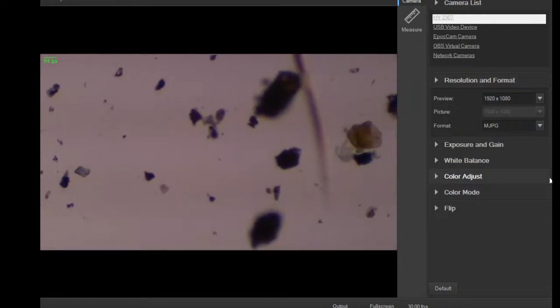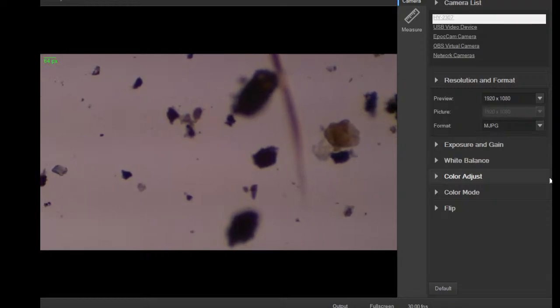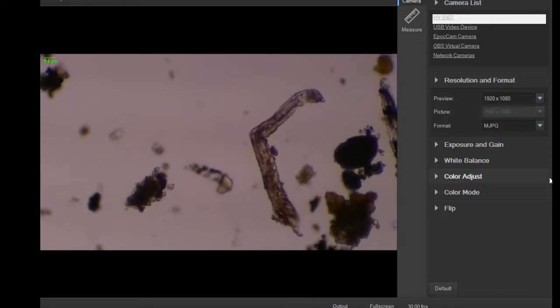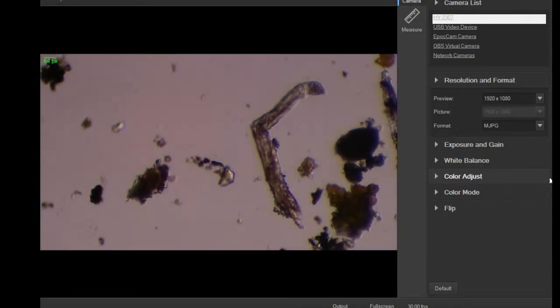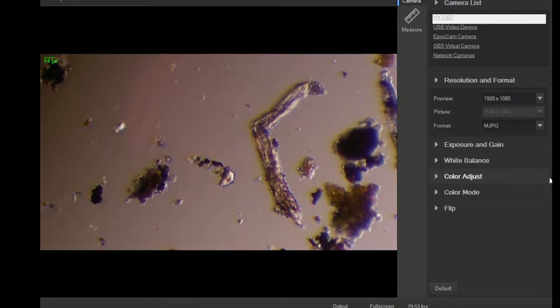Alright. Pretty small one too. It's about 100 power. There you go. There it is again. I'm going to change it to a dark field if I can. Let's see here. At least I'm using oblique lighting so you can see them a little bit better.